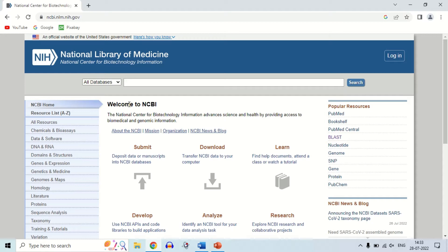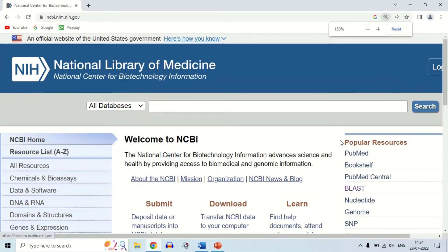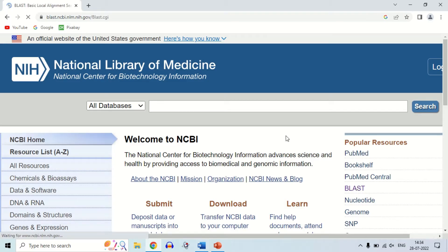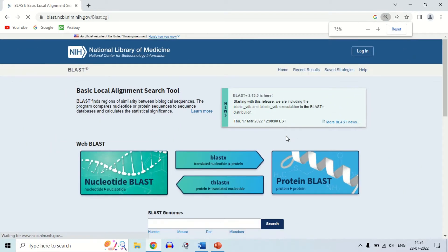For those who do not know what NCBI is — NCBI is the National Center for Biotechnology Information. There are lots of options here. Now we have to perform BLAST. You can see here — this is the BLAST option. So you have to click on the BLAST option.